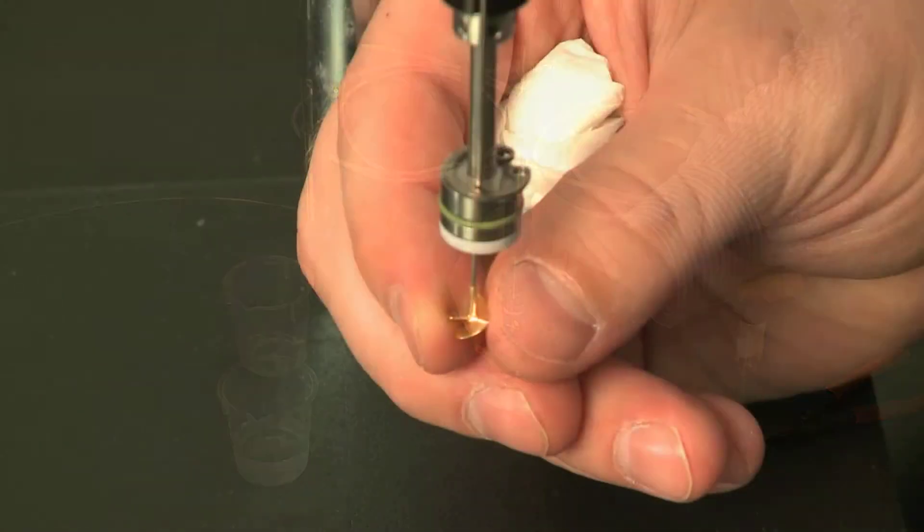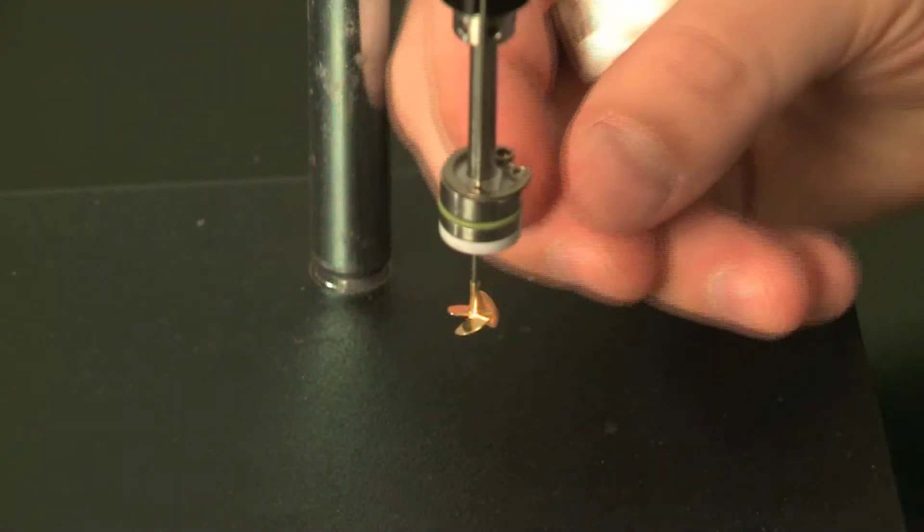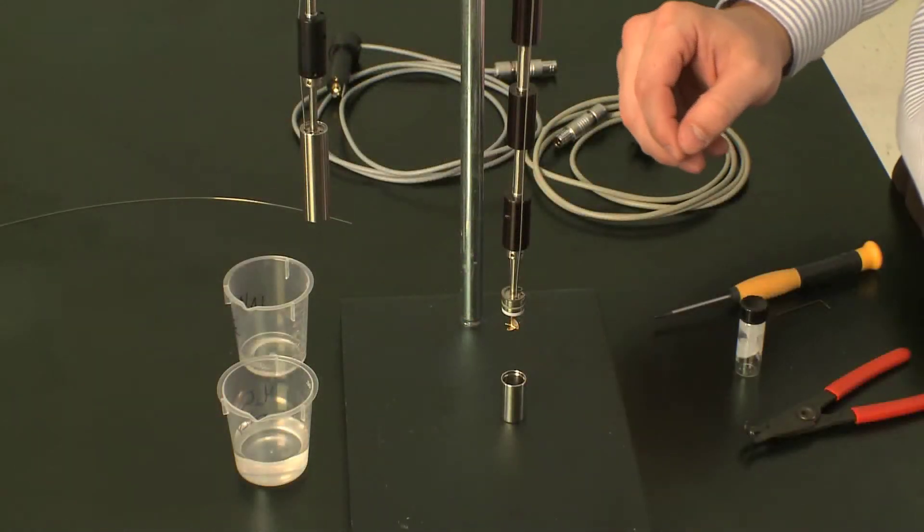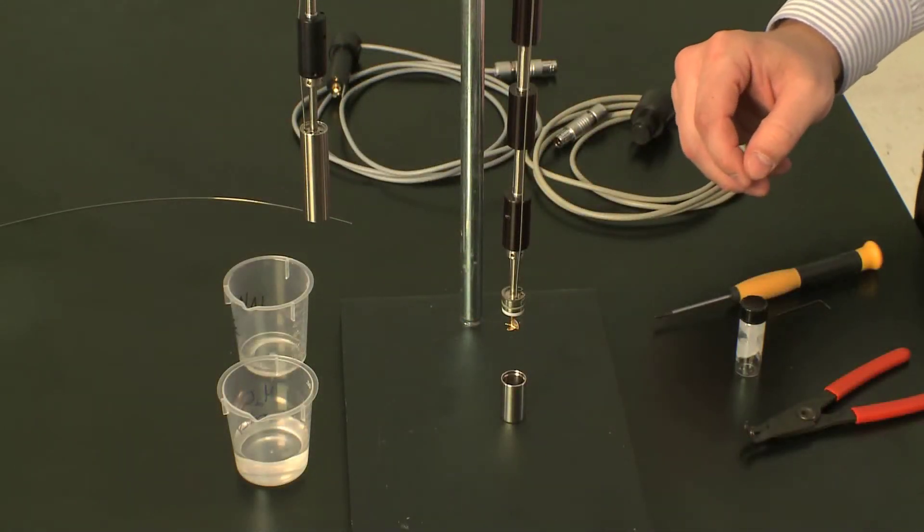Then I'm going to move it up about 1 millimeter or so, so I know the stirrer isn't rubbing on the bottom of the ampule during the experiment.